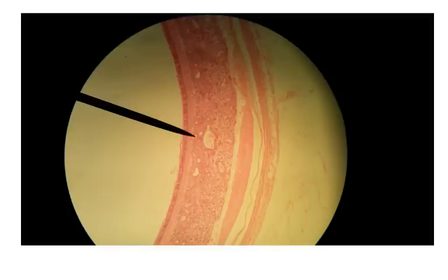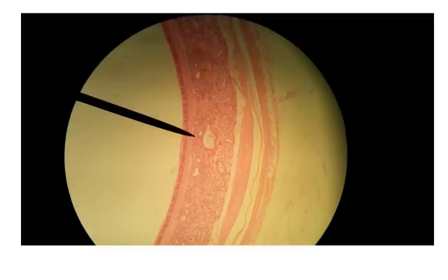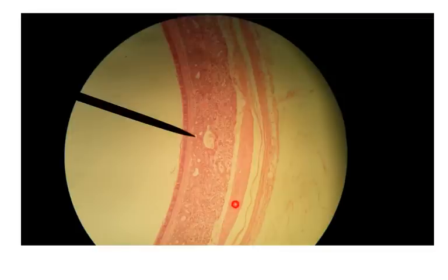This right here is hyaline cartilage, and that forms the C-shaped rings that give structural support to the trachea and help keep the trachea from collapsing if there's much pressure applied. These hyaline cartilage rings run about three-quarters or maybe a little bit more than that around the trachea.